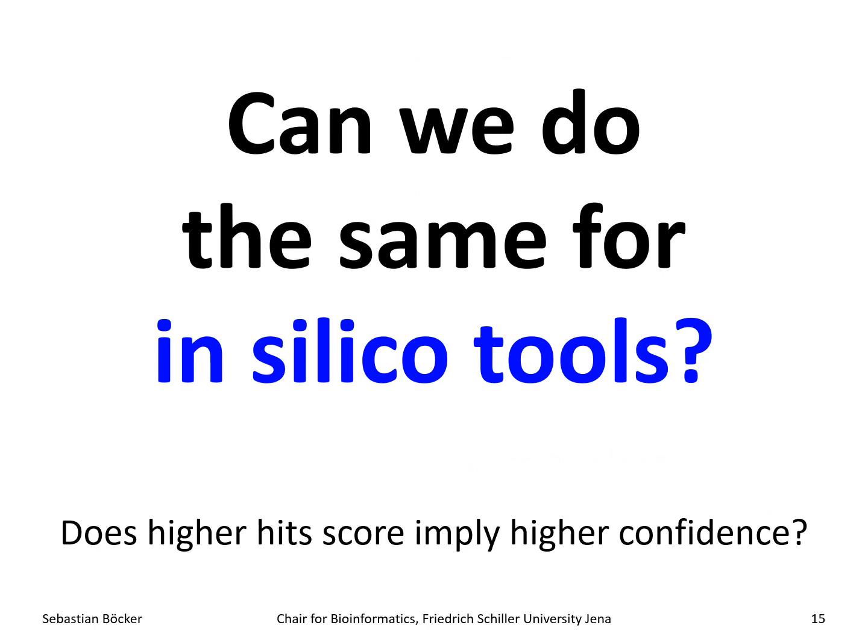Now it's a rather obvious idea that we could do the same thing that we did for spectral library search also for our in silico tools, such as CSI FingerID. I don't mind which one, any one. So we have the score of the highest ranked candidate. Can we use that to differentiate correct and incorrect hits?